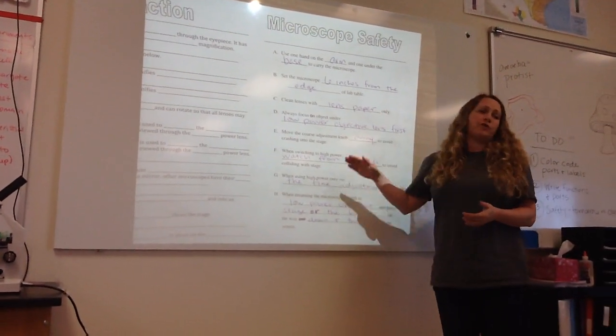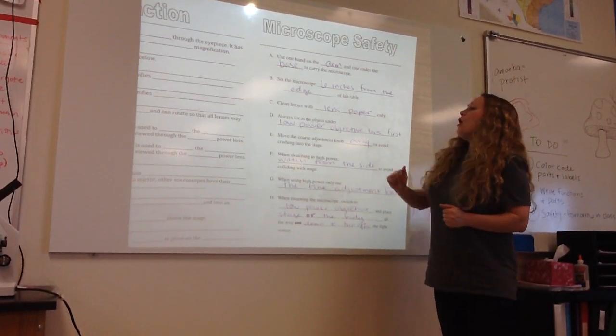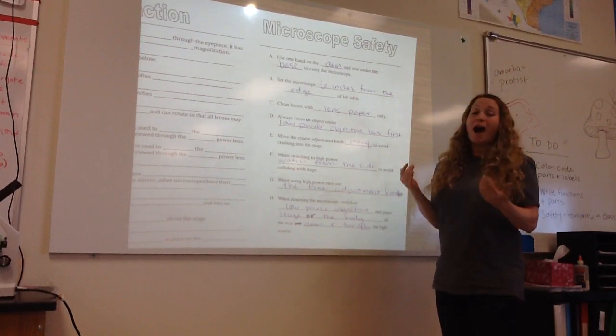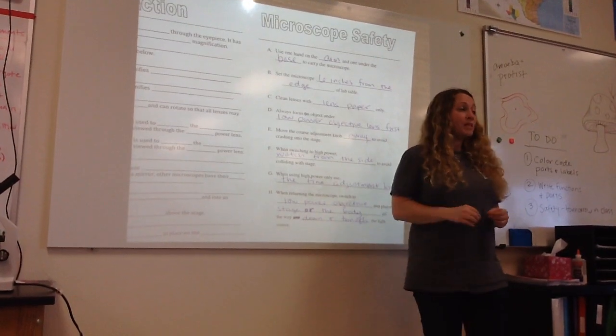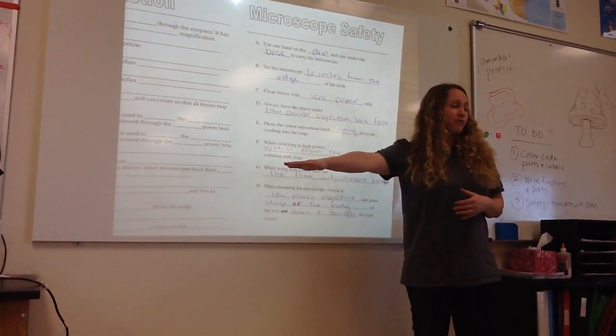There's a couple of rules for how to focus. I'm going to go over them, then I'm going to show you them. So, you always focus on low power objective lens first. If you try to use the higher power first, it's really hard to find the object. That's because the object is microscopic. It's tiny. That's the point of the microscope, right?